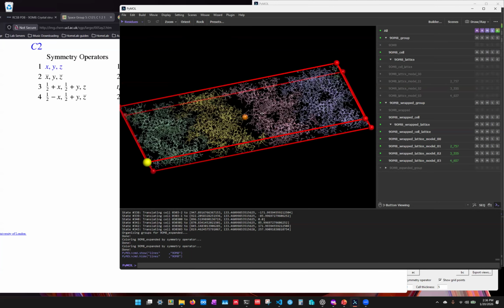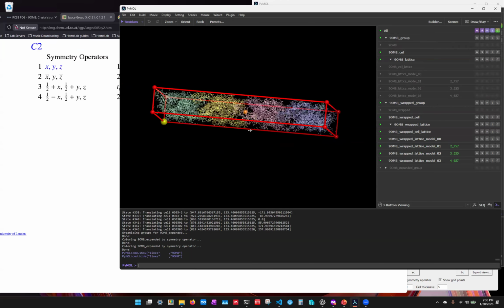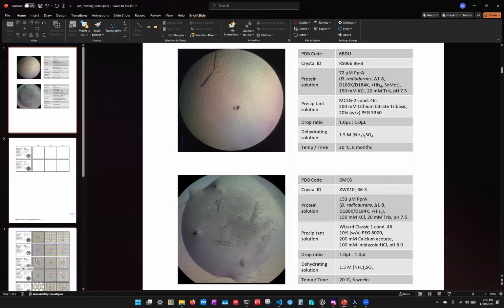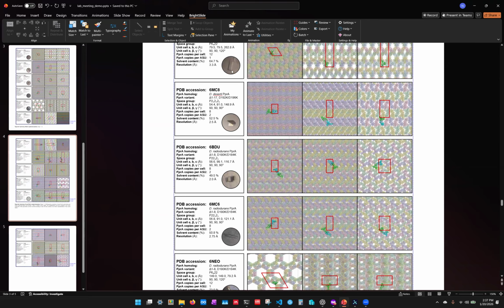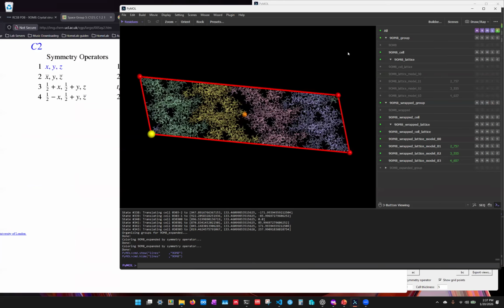So you can see this is like the full unit cell now, completely filled. And I think in this case we have what's our volume? I do have a question. Your analogy was that it's just coming around to the other end, but that is no longer the shape of the... So why did they define it that way, rather than just based on how they're stacked?